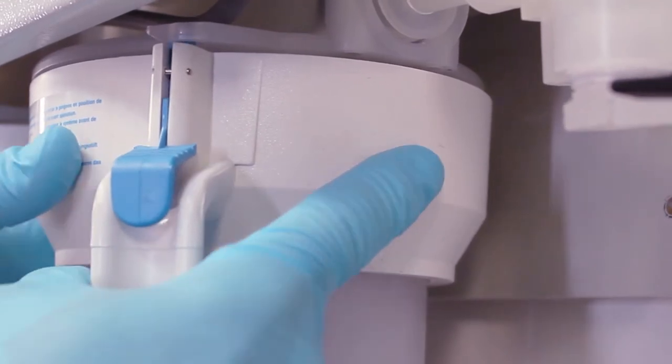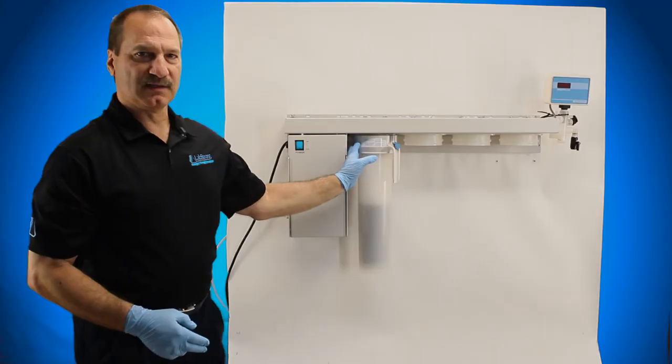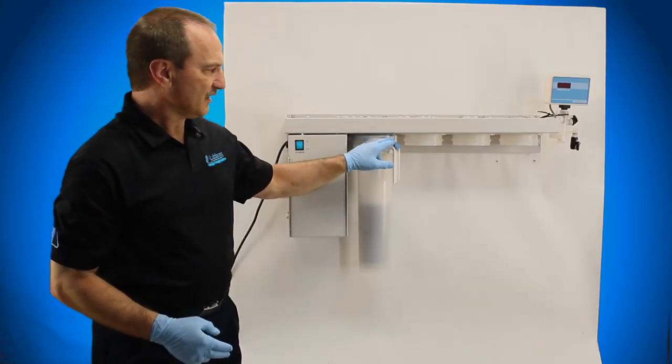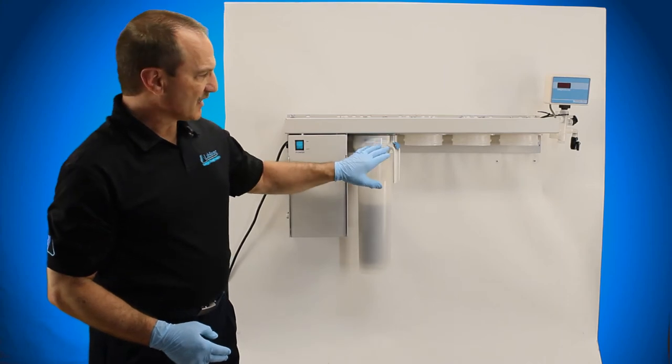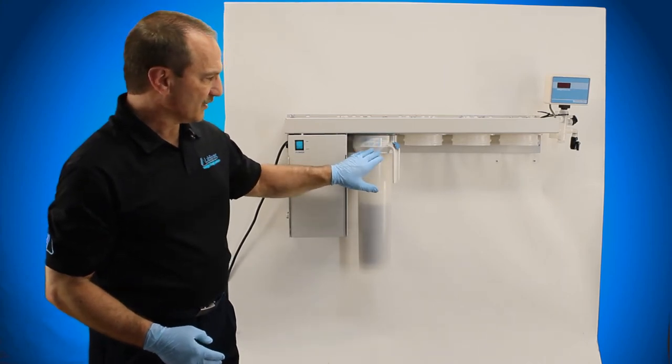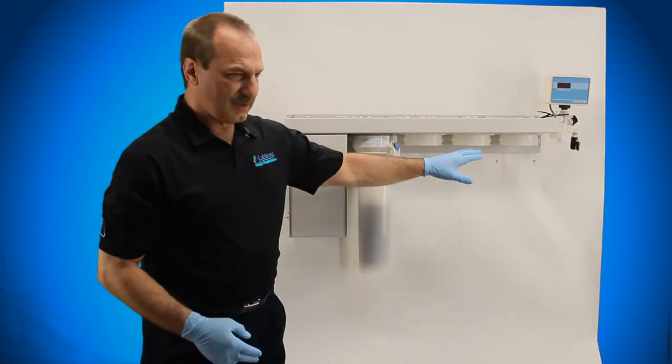So you hear one, two, three clicks and it's in place. You don't necessarily have to get it to the third one, but at least to the first one. It depends on the tolerance of the canister, the handle ring and the head section. You're going to do this for each and every unit.